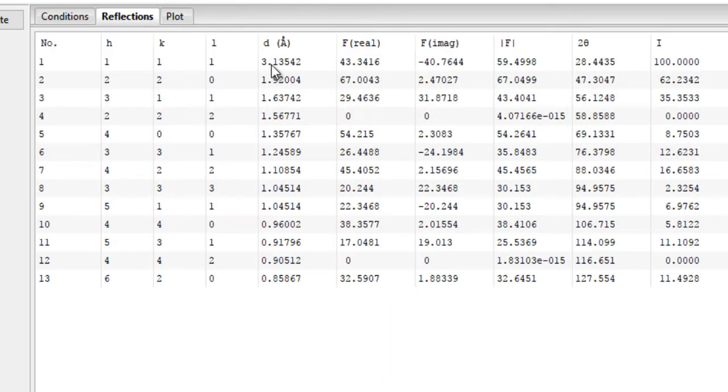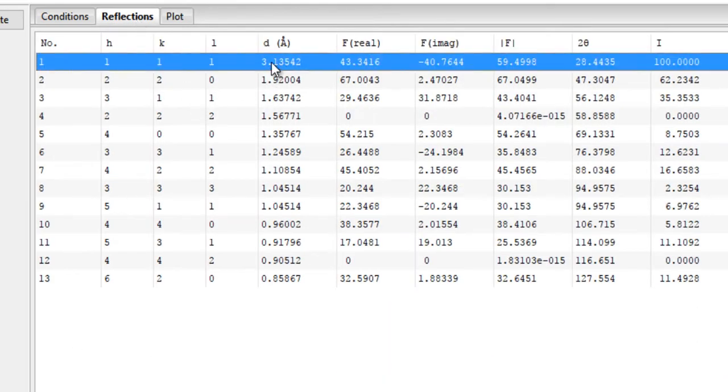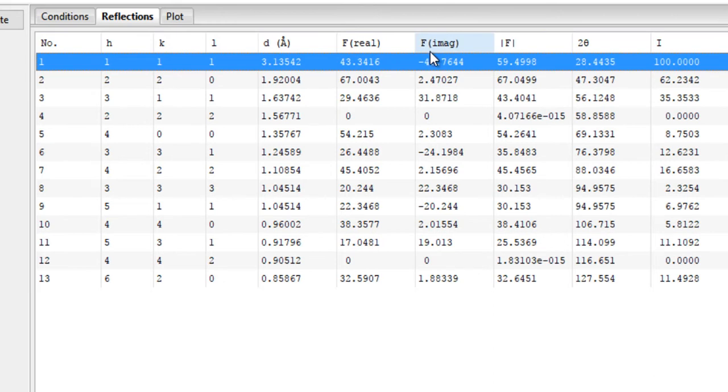You have the corresponding inter-planar spacing, then the structure factor, the real part and the imaginary part, and then the mod of the structure factor, and then you have the position of the peak.